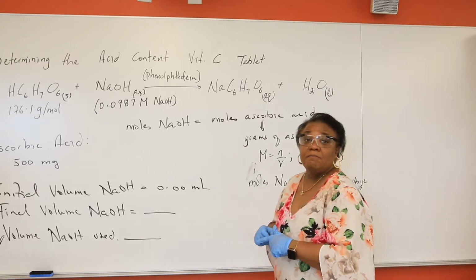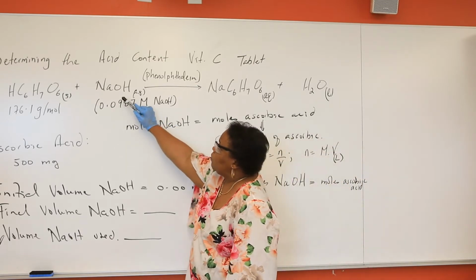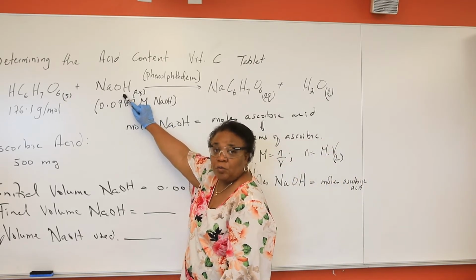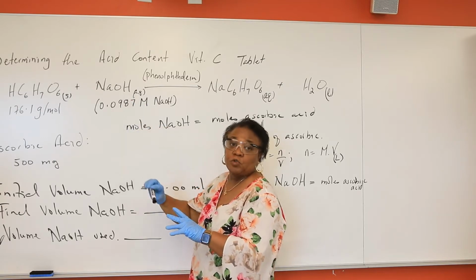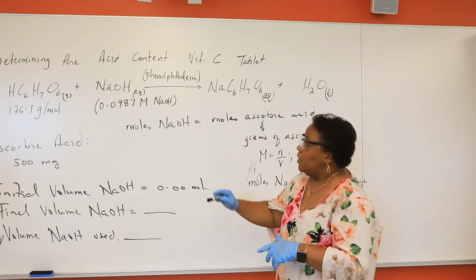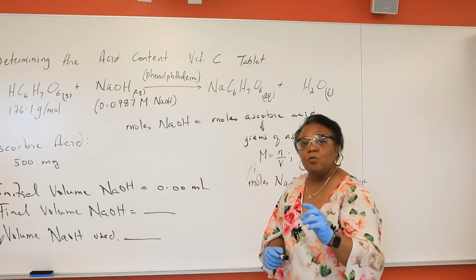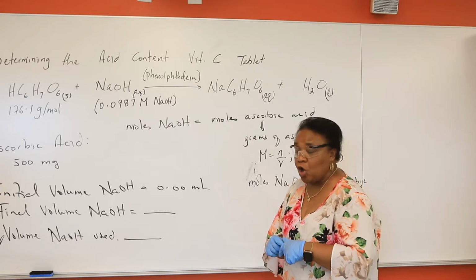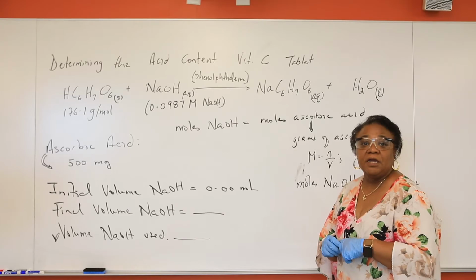Now, care again must be taken. This is a titration experiment, so we want to make sure that we're not over-titrating. At that end point, the solution again should be faint pink. Just as a reminder, when you're using that burette, do not forget that the tip of the burette must also be completely filled and void of any air bubbles.